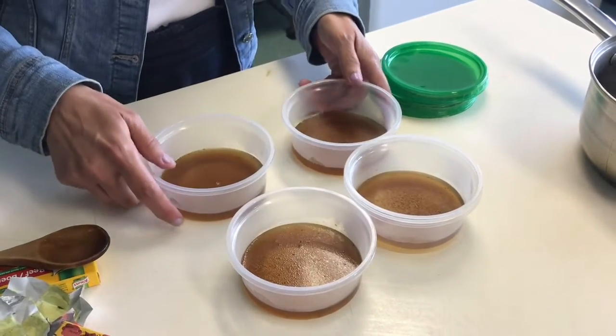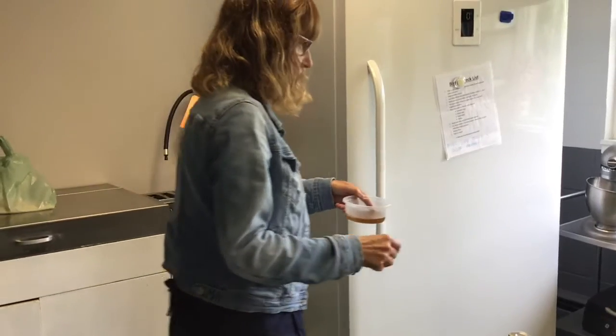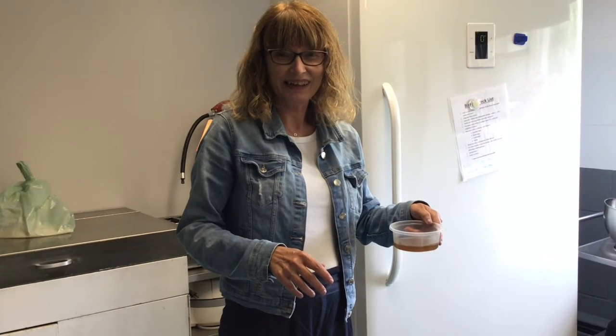I'm going to put this in the fridge for a few hours and then put lids on. All of these are just going to go in the fridge, and then we will be back for part two to swab the tables. Thank you, bye.